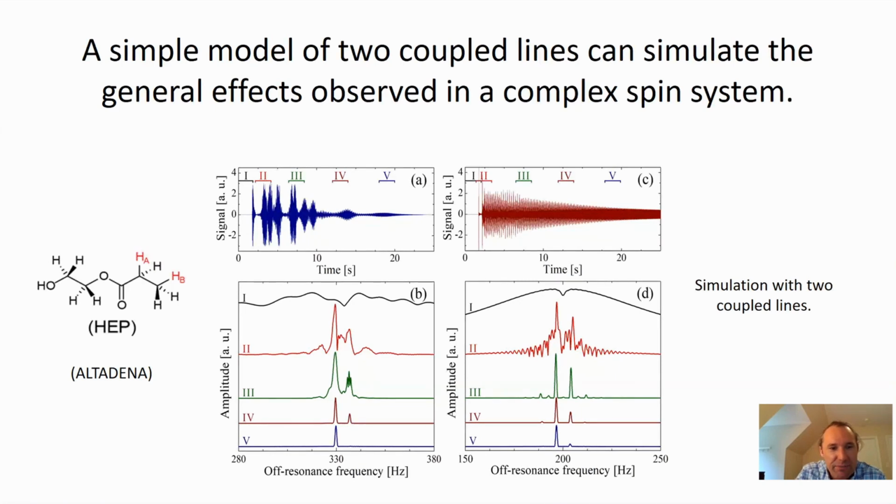And you can see that in the very beginning, at very high polarization levels, the behavior is broad and very chaotic, and then decays into more orderly behavior until at the end, there's only enough polarization to be over the threshold for one of the lines. That's all the way in the bottom in 5. And you can only observe that line for a very long time.